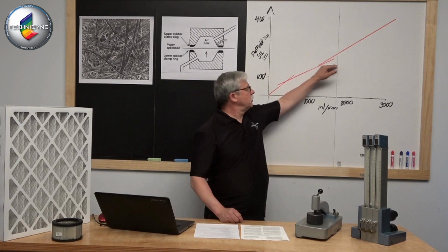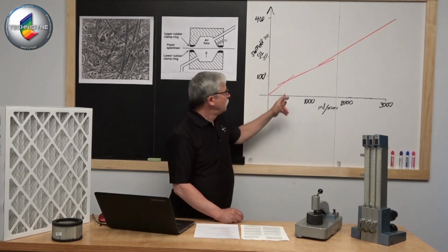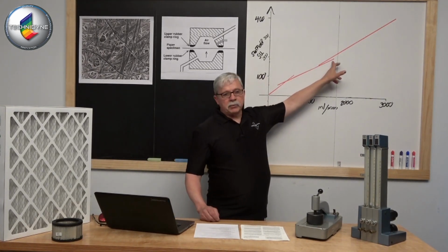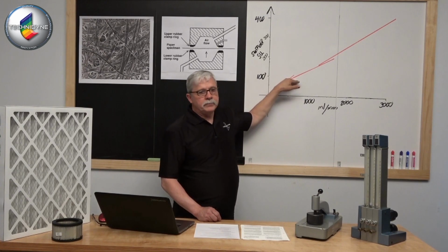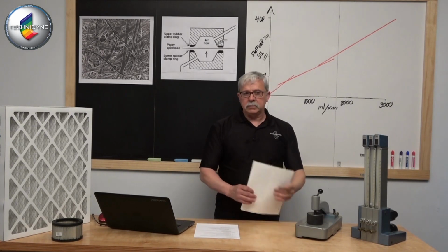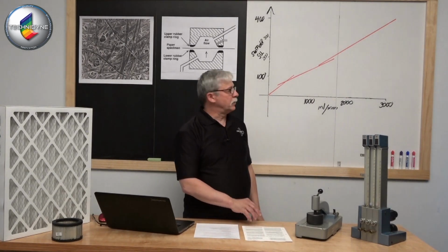The next, which represents the relationship between milliliters per minute and the center tube, runs from, again, roughly 50 Sheffield units up to around 180, 190 Sheffield units. That slope is a little bit lower than the first slope. You'll find all the defined slopes and intercepts in TAPPI T 547.